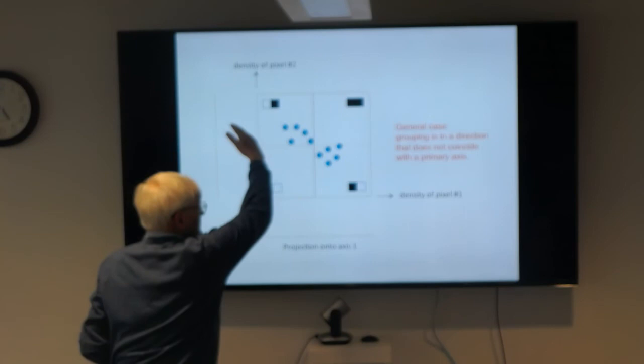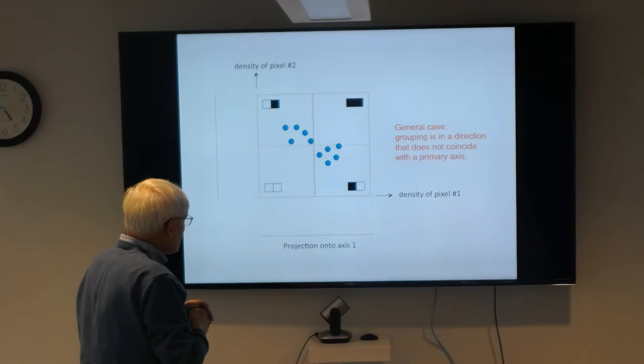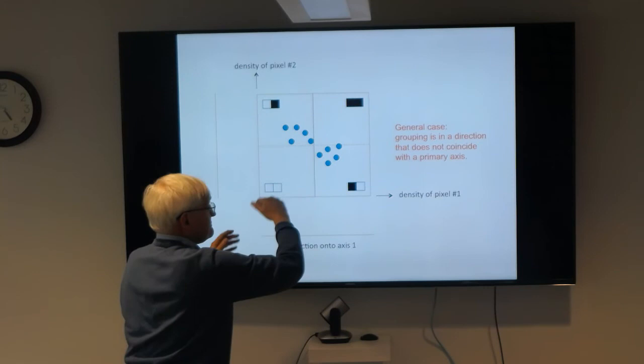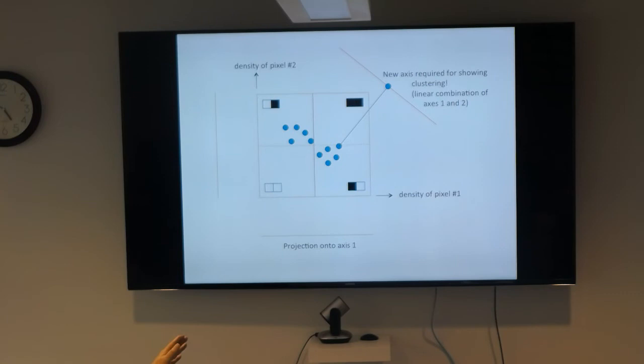So the whole multivariate statistical analysis approach finds this first axis of best separation. And then it finds the next axis that gives separation in the other direction and so forth. Okay. So this is the axis that we require that immediately solves the problem. Okay? So we need to find that axis. And we throw the initial coordinate system away. The initial coordinate system is really the one that is defined by the Cartesian coordinates of the image.